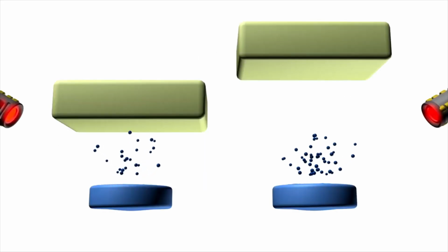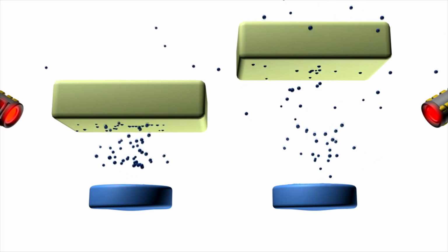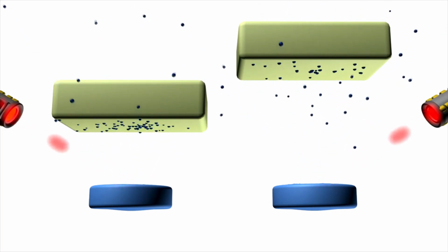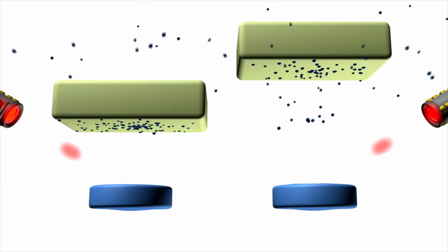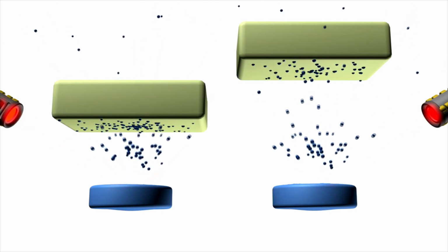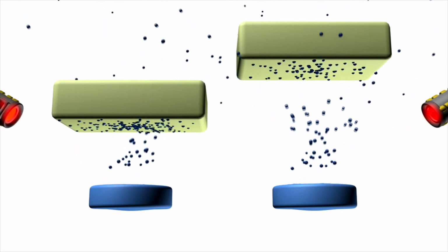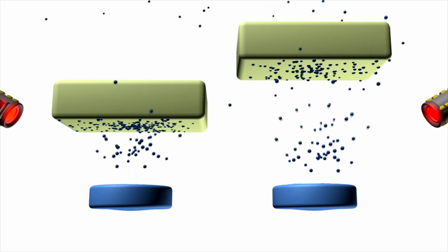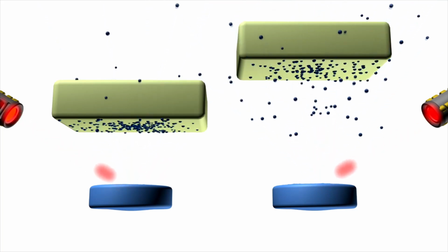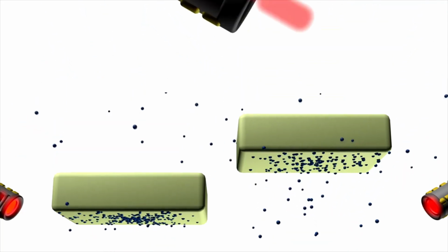For instance, the amount of deposited material per surface area unit obviously depends on the distance between the target and the substrate. If the distance is greater, then less material is deposited. However, the film might also have a higher quality, as the energetic properties of evaporated material reaching the growth substrate often show an optimum or sweet spot where the growth of high quality film is encouraged.